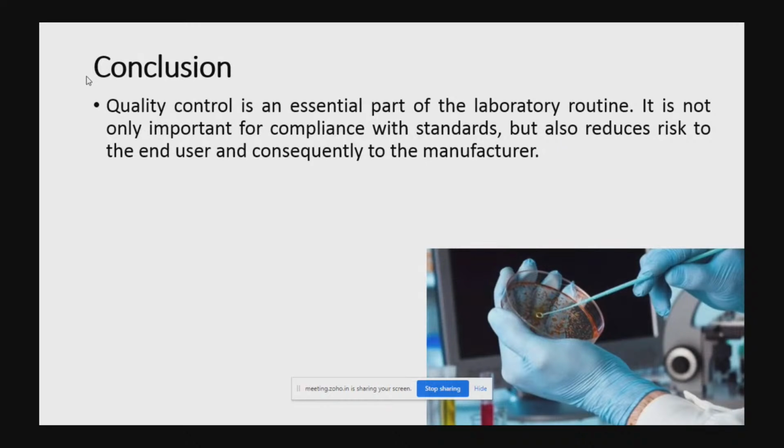In the current scenario, everything is available in ready-to-use forms. By using these ready-to-use forms, first of all, we can save microbiological time. Second, by using ready-to-use pre-sterilized materials, we can avoid falsification of the result. Also, we are saving our processing time, and we can give the outputs in minimum time using these ready-to-use things. So this is the final conclusion.